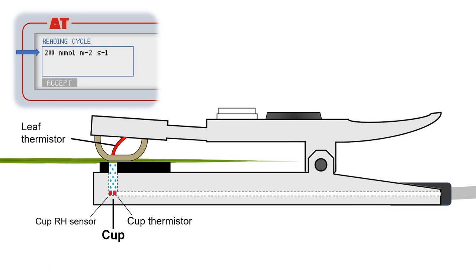After each measurement, dry air is pumped from the body of the AP4 into the cup, resetting humidity levels, and a new measurement cycle starts. This two-step cycle continues briefly until a consistent leaf conductance reading has been established.